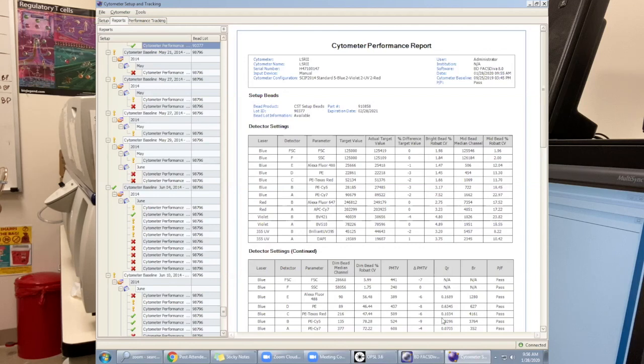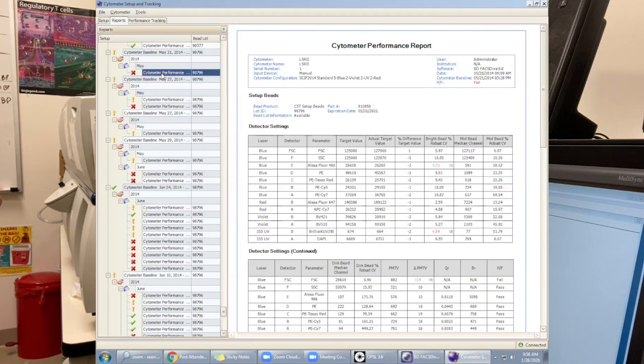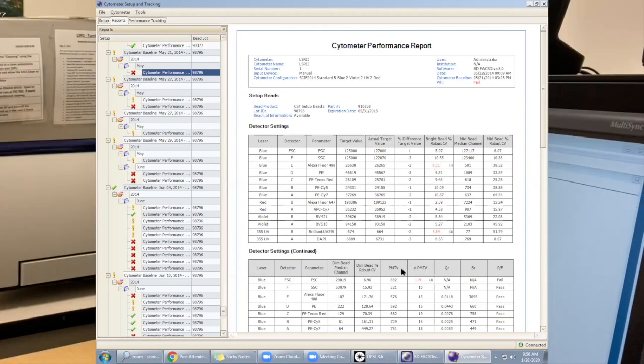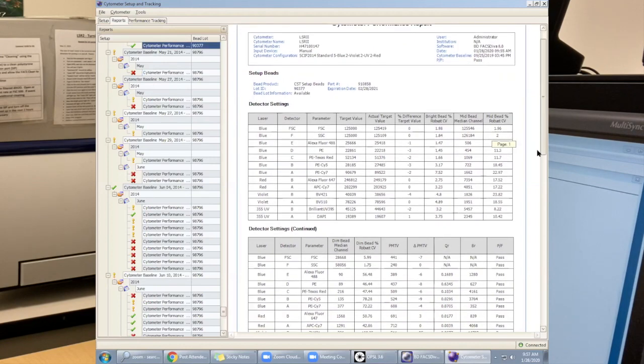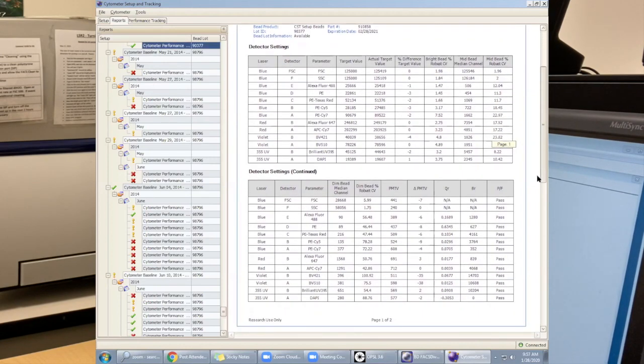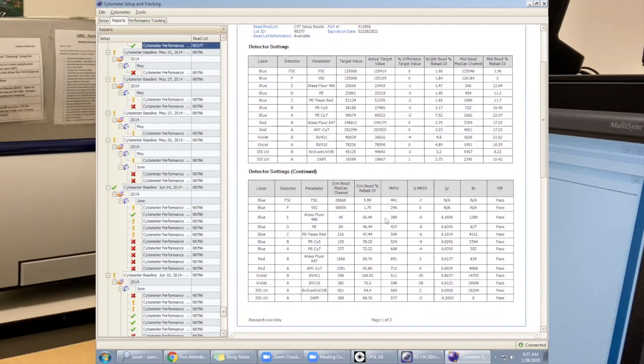It will look something like this, seeing that it's too high and that the CST failed. But seeing our numbers are good, they're pretty low.